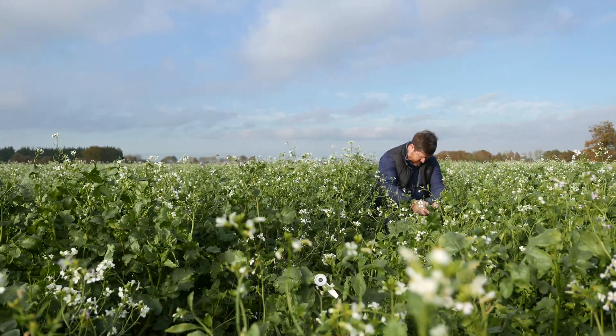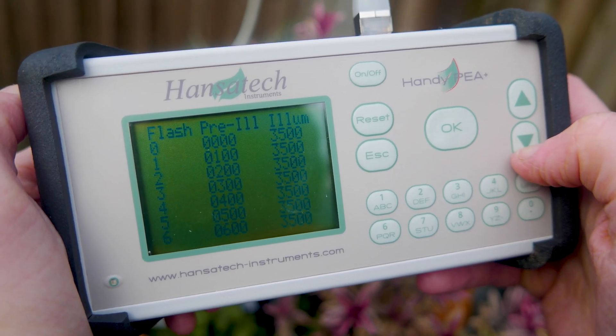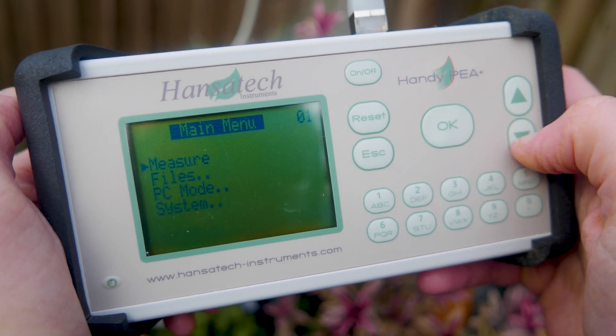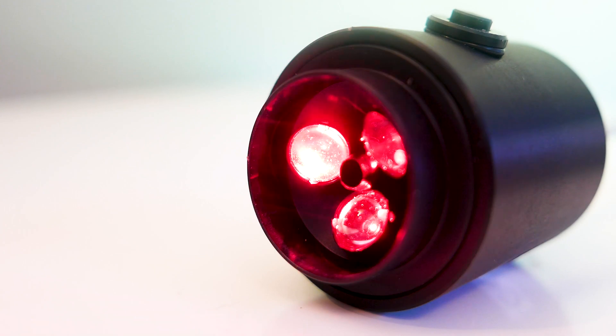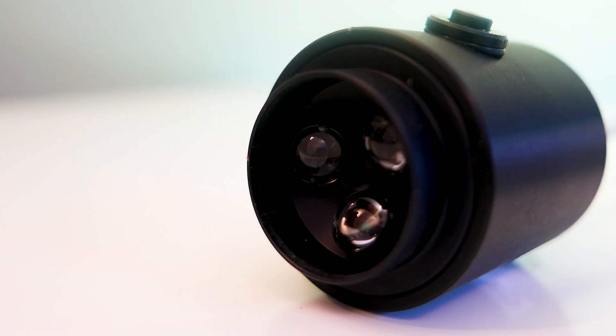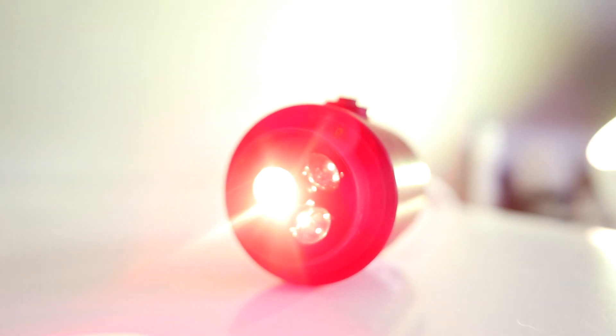The instrument stores six different protocols, ready for use on demand with a single button press. As well as single flash measurements, you can program multi-flash sequences with light intensities of up to 3,500 micromoles per meter squared per second, and durations of between 0.1 and 300 seconds.